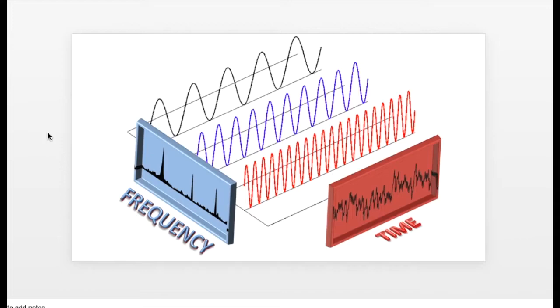So the Fourier transform is a great way of looking at another dimension of a complex wave. When we look at complex waves like this, we're looking at them in what's called the time domain, that is, time on the x-axis. But the Fourier transform shows us the frequency domain, that is, which individual sine waves comprise the complex wave that we see in the time domain. And because the data that we generate in the LCPC method is discrete data points, that is, we don't have a smooth line for every point along the x-axis, we apply what's called the fast Fourier transform.